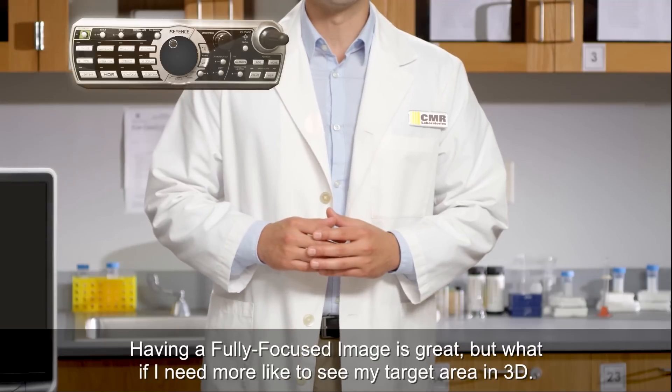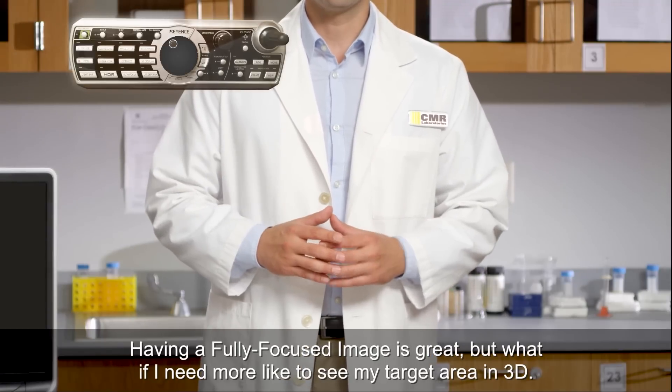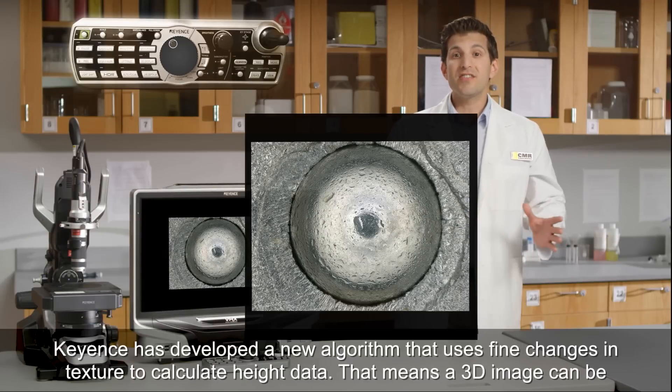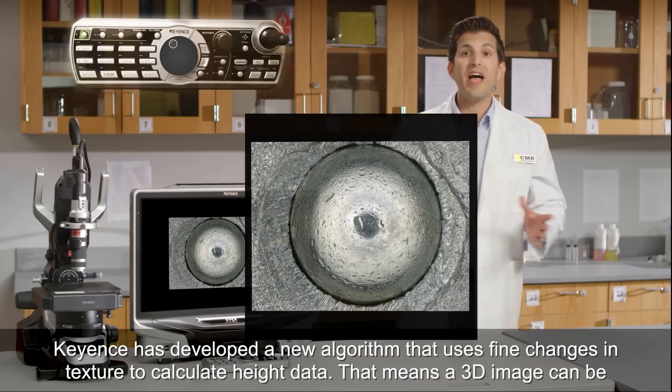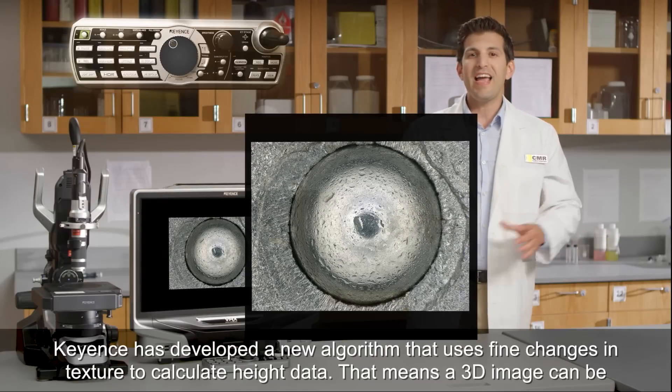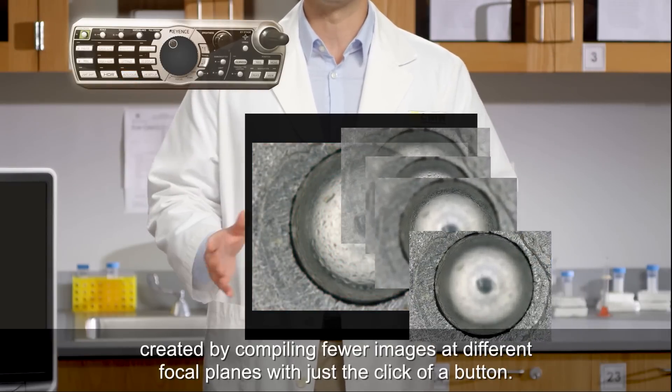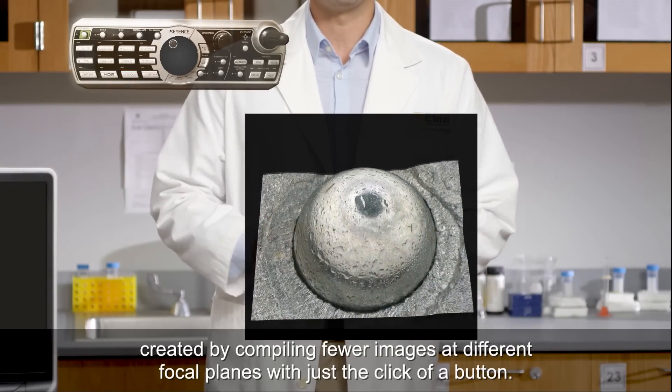Having a fully focused image is great, but what if I need more? Like to see my target area in 3D. The VHX5000 has you covered. Keyence has developed a new algorithm that uses fine changes in texture to calculate height data. That means a 3D image can be created by compiling fewer images at different focal planes with just the click of a button.